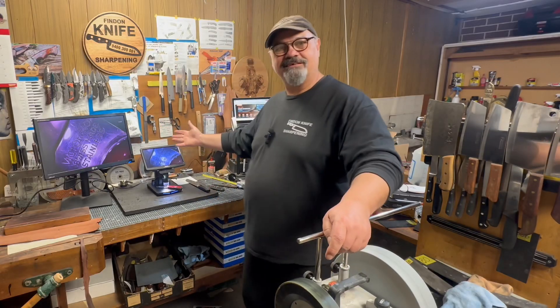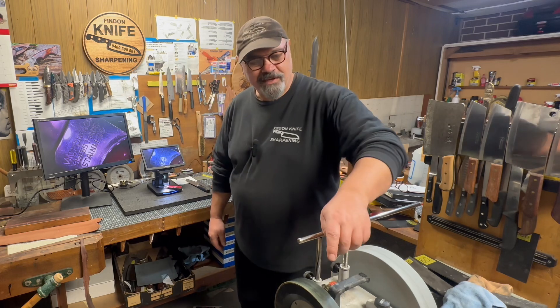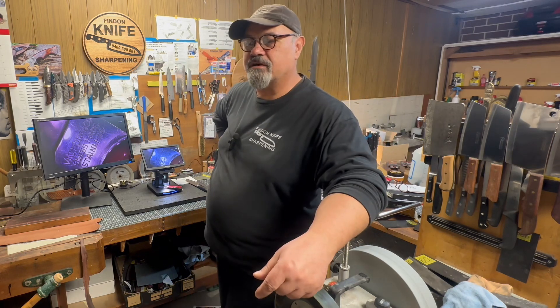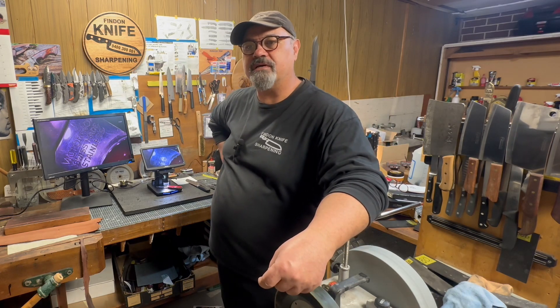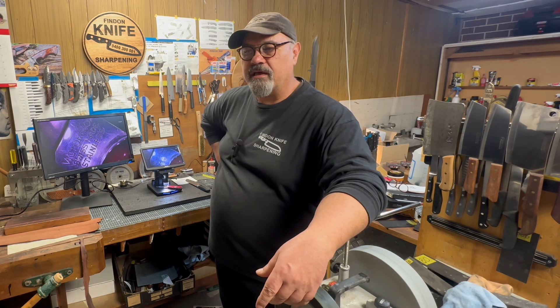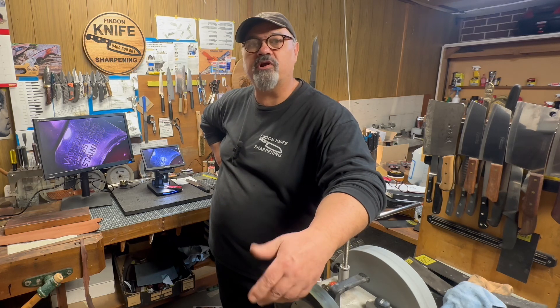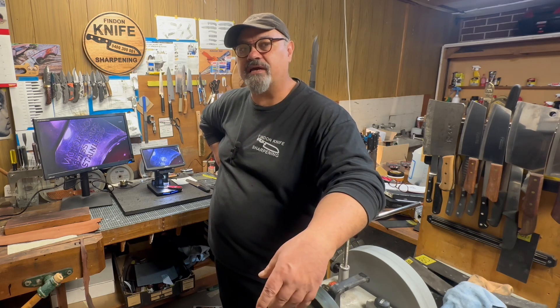Hi everyone, have a look - digital microscope! So what happened was I got an email the other day from a Chinese company, Vivo. You must have heard of them - they've been contacting a lot of channels to review products and they've really got a big marketing push at the moment.